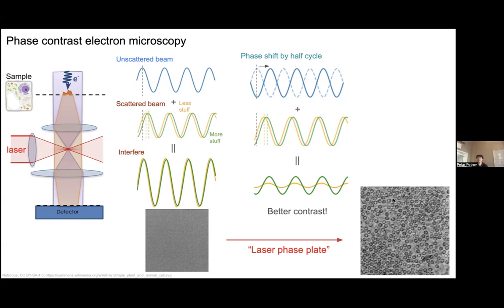Mine is just more of a practical question. So basically the idea is that you're getting more data per image. That's the application of the phase plate. You can get more high quality data, which means you don't have to take as many images, so you don't damage your sample as much. So how much quicker is it? Between these two images, how many images would I have had to take of my left image to get to my right image by layering a bunch of them on top?